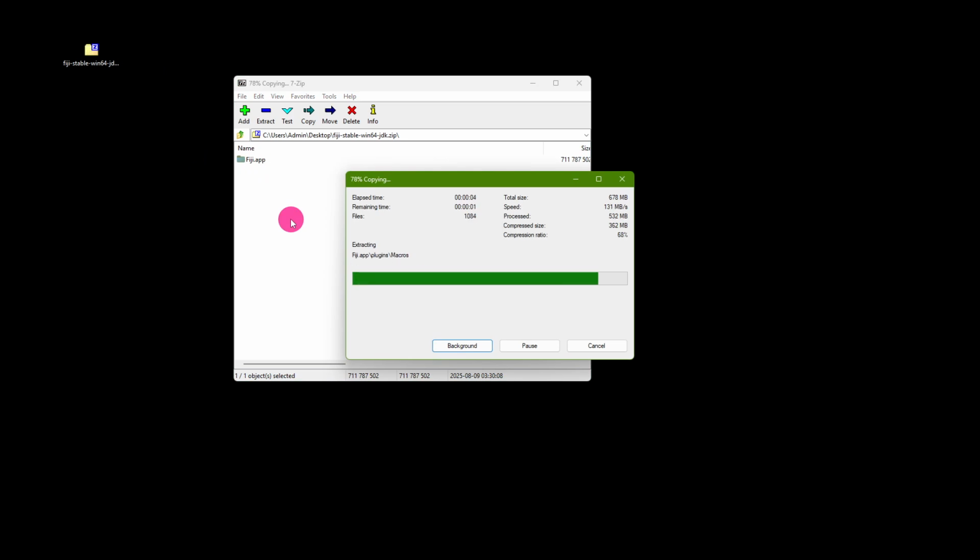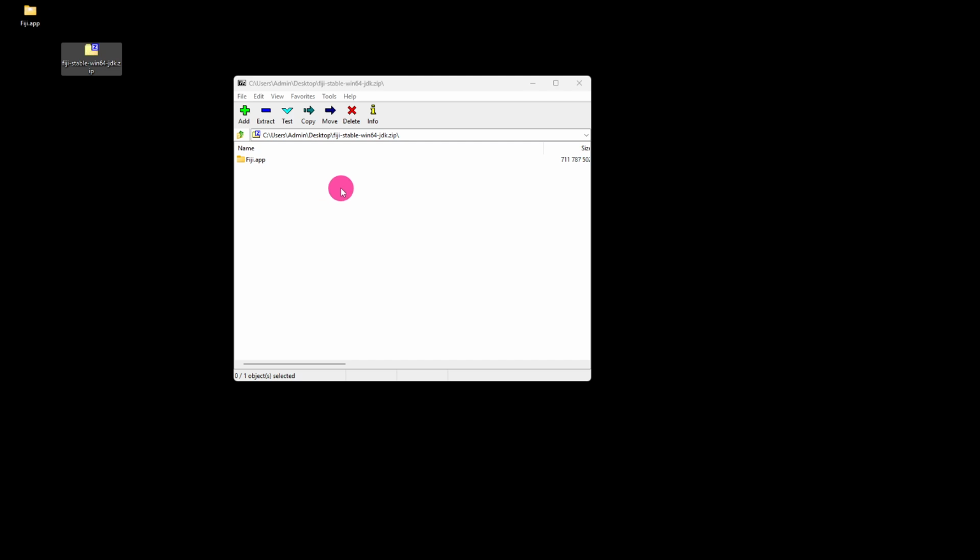So the installation location for Windows should be your desktop in the best case, or any folder that is not close to the operating system. This means, as mentioned also on the installation page, please do not on Windows install it into the program files, and please do not unpack it into the download folder. So easiest is your desktop.